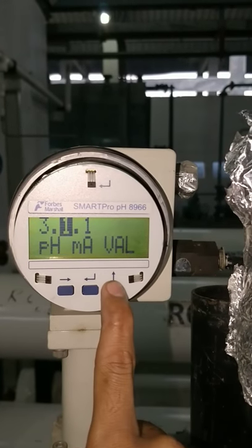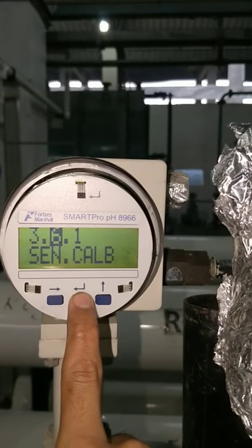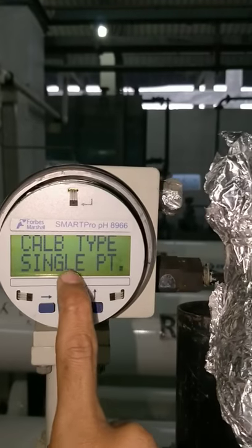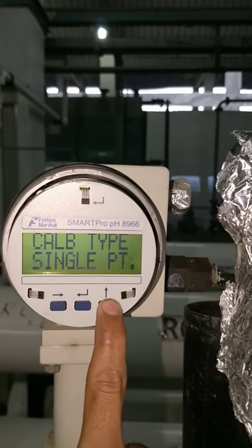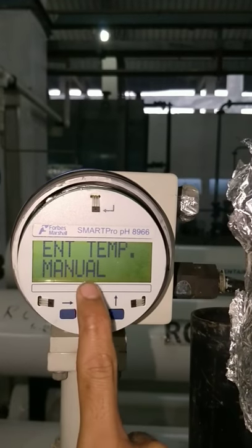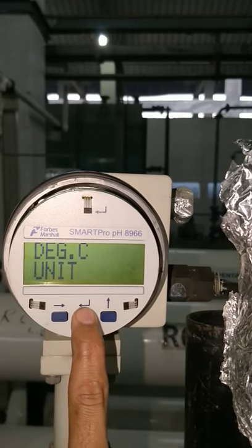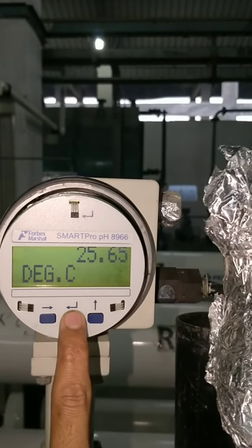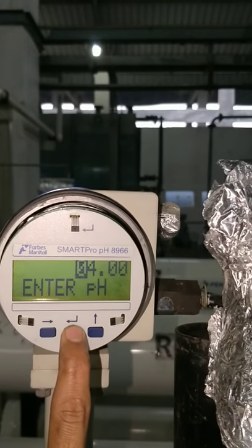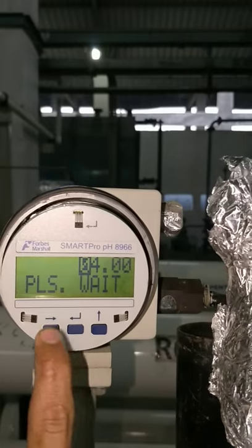For calibration, the menu code must be 3, 6, and 1. This is the enter key for sensor calibration. There are two options available: single point and dual point. We will select dual point for accuracy. Enter temperature — this must be in auto mode. It is reading 25.64 degrees Celsius. For the first point, we will set the PH manually and press enter.